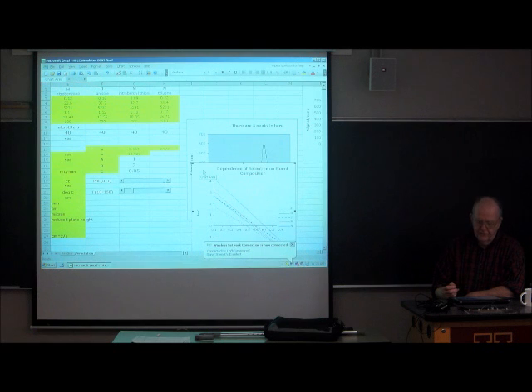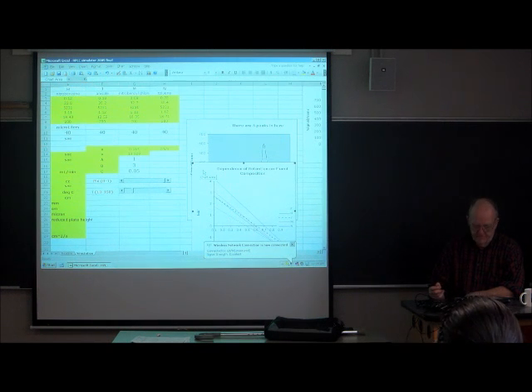However, temperature also has an influence on retention. Generally, as you increase temperature in reverse phase chromatography, there's a decrease in retention. And there's definitely an optimum temperature, and there's definitely an optimum mobile phase composition. And so the first job for you guys is to find the best separation of this 5-component mixture.